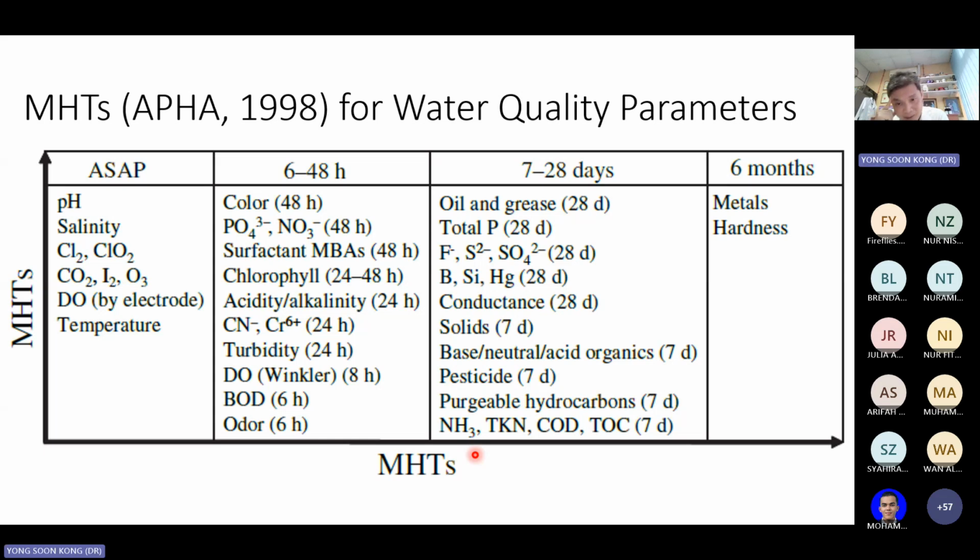But here's one thing that I also need to remind you, and I just found out that COD, last week I told you just chill it, right? But apparently COD also was recommended that you add preservative, and that preservative, fortunately is the same with ammonia. So COD here also preserve with sulfuric acid.